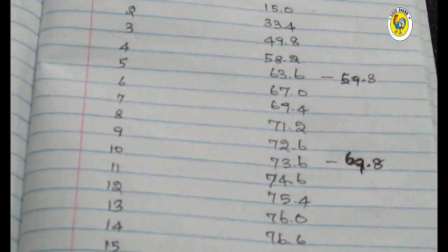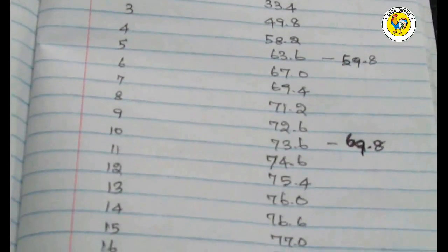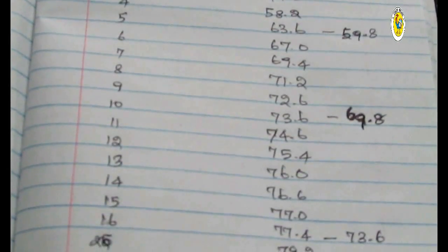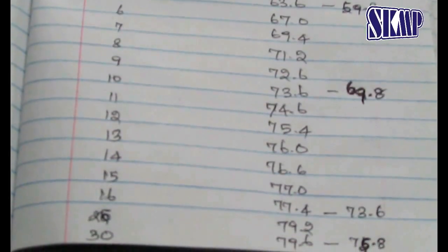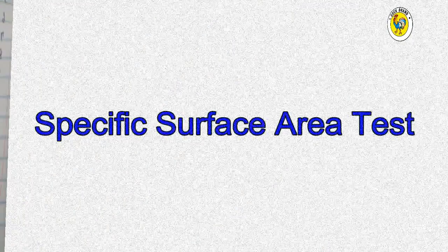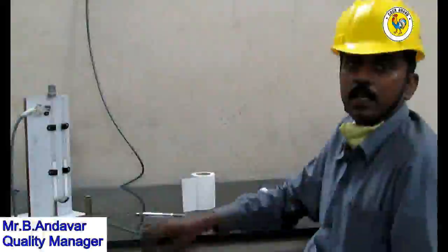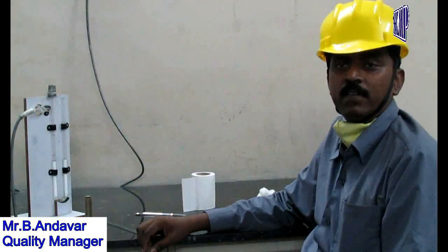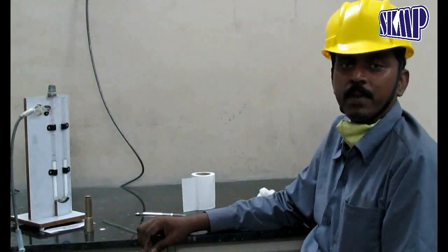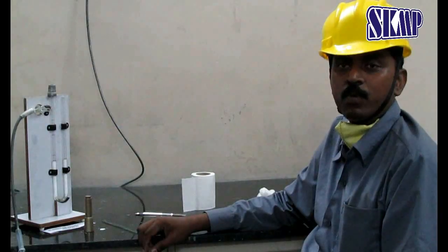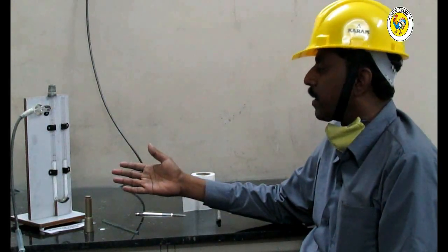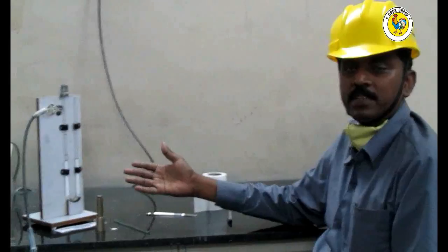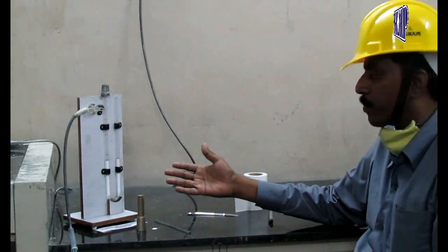We achieved the requirement. This is an air permeability apparatus used to check the specific surface area of aluminium powder.